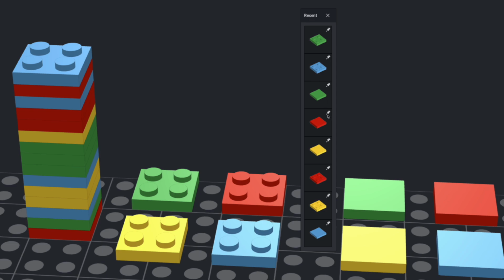And they're added into the sequencing reaction basically at random by Taq polymerase as it's extending off the DNA molecule. And so with every additional base that's added, either a dNTP is added, allowing for the continuation of sequencing to follow, or a ddNTP is added, stopping any further extension of the PCR product.